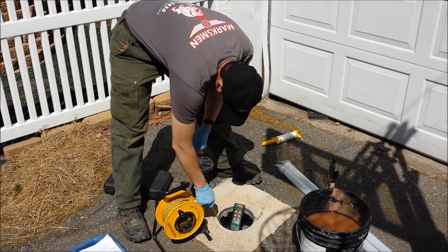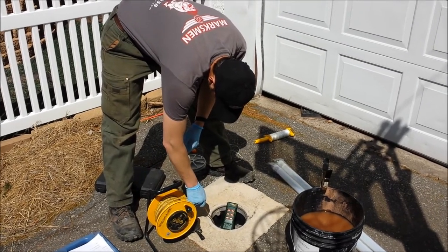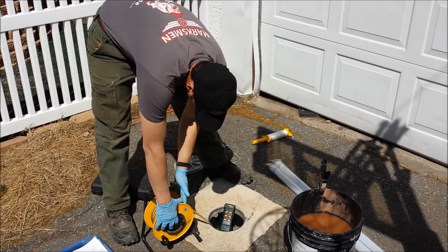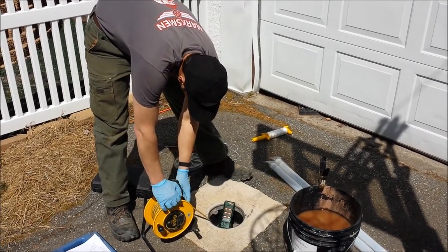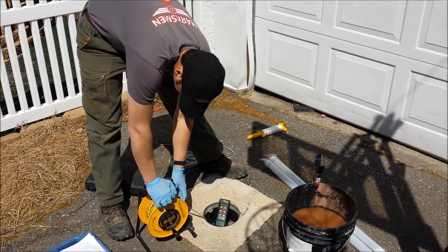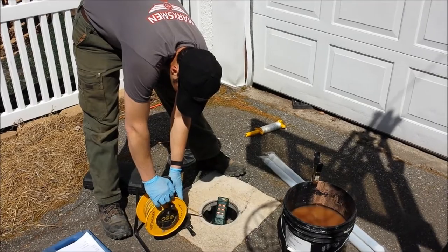Here's Nick getting another round of static water levels. We have to actually do this before purging, after purging, and before sampling, because the DEP wants to make sure we have not over-pumped the well. We want to just keep the water table down about 2 feet from its original static water level condition.